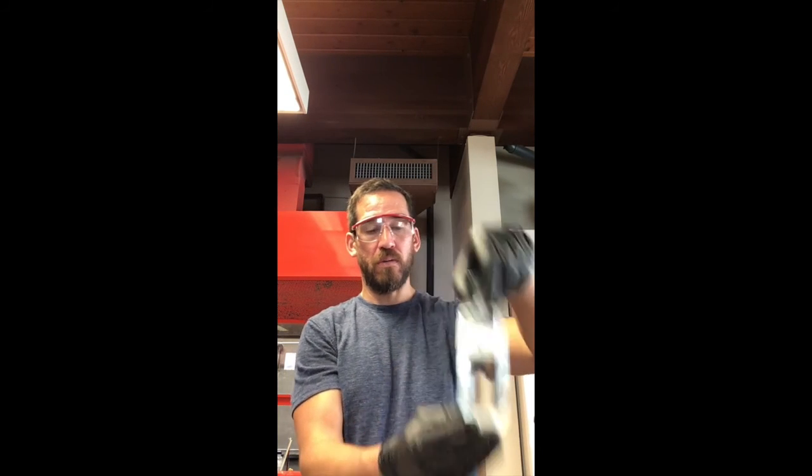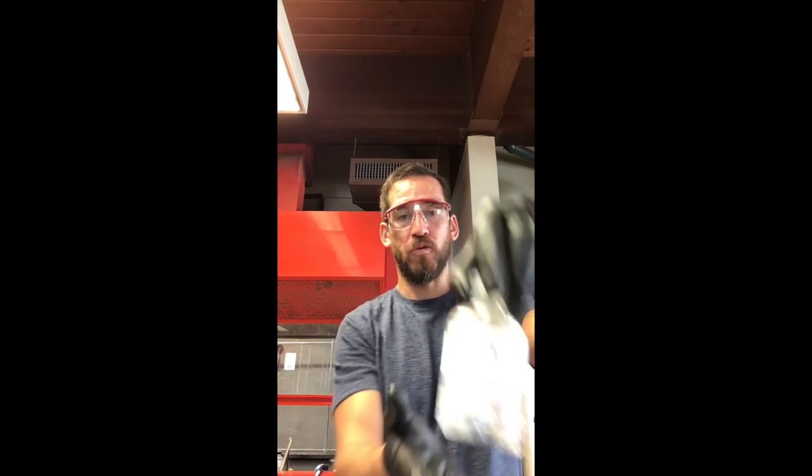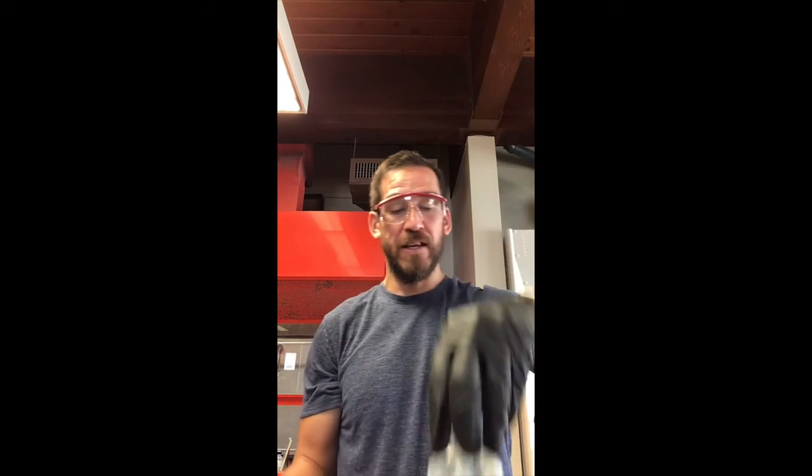Basically, what you'll have is something that's labeled 1, something that's labeled 2, something that's labeled 3. What do you think the last one's labeled? 4. Nice. All right, so basically, what I want you to do is lay out a procedure telling me what you would do to figure out which is the organic layer and which is the aqueous layer.